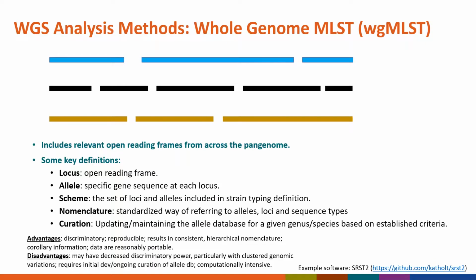One of our primary methods we use as part of PulseNet is multi-locus sequence typing. As Duncan alluded to, there are a few different flavors of that. We use whole genome and core genome multi-locus sequence typing. If you're not familiar with multi-locus sequence typing, or MLST, some key definitions for the method include locus, which is an open reading frame.